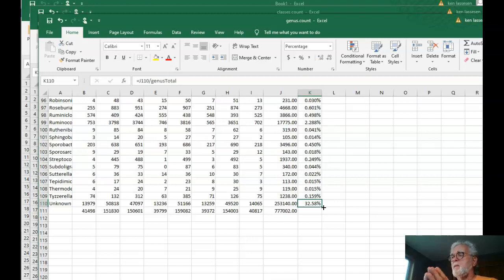Something to consider. It means that there may be significant players out there which are anonymous. So we wait for the next little bit of joy for science to advance. At the moment, we get a pretty good idea down to certain levels, and we identify some of the next levels down accurately. But once we get to the genus level, we start running out of a high degree of identification. We identify 68%. When we go down lower, it flips around. We barely identify 30%. So we need to be careful about assuming that we know more than we know. A wise man knows how little they know.